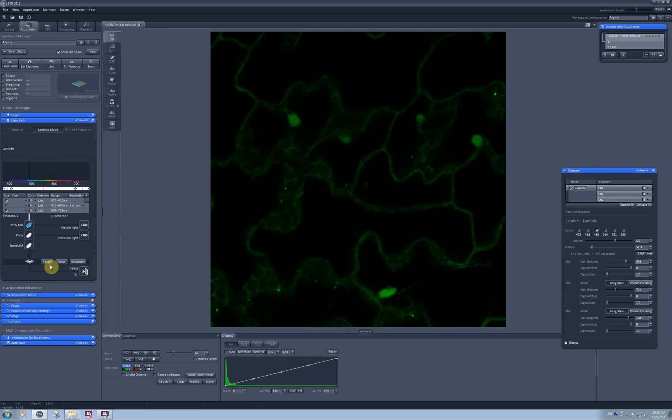Linear unmixing will be based on quantification of intensities. Spectrum will be built based on the quantitative analysis of intensities in your image. So you need to make sure that there will be no oversaturated pixels.